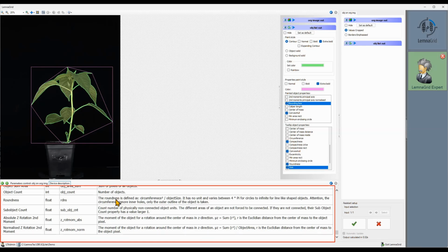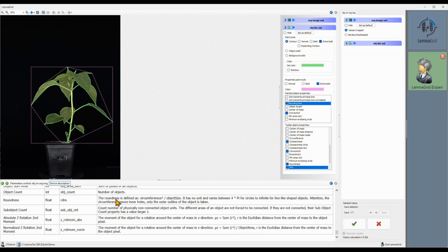Please note, not all of these parameters are present by default. Some of them need extra devices in the grid to be filled with reasonable values. For example, the color-related parameters. We will cover this in later videos in more detail. Defining this image is not just for viewing pleasure. Each writer creates not only the data table, but also at least one image to represent the analysis result. Here you define how this image will look like.